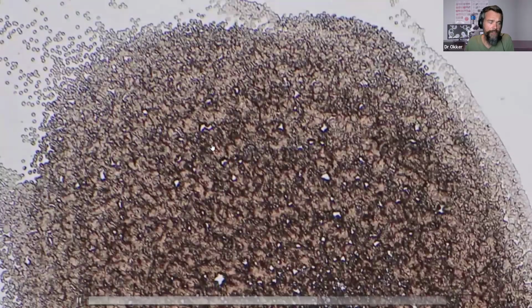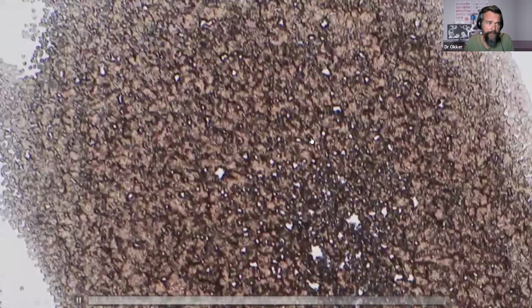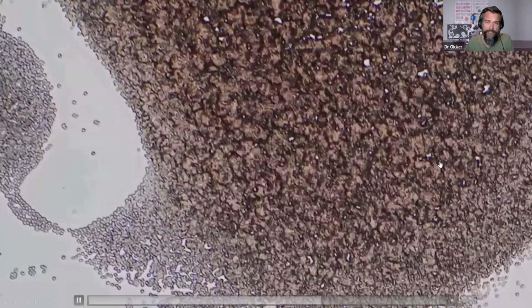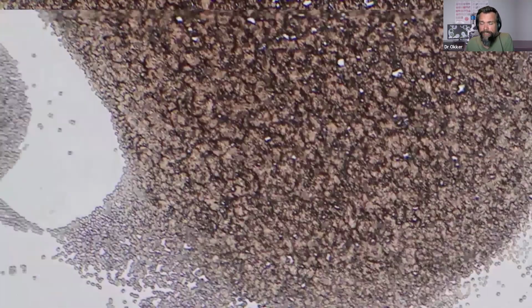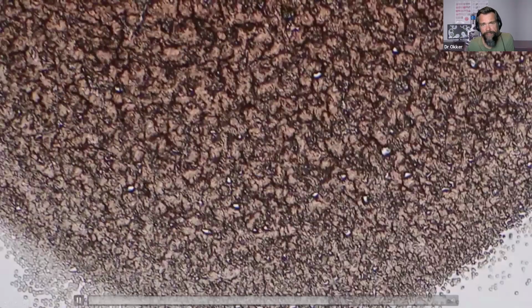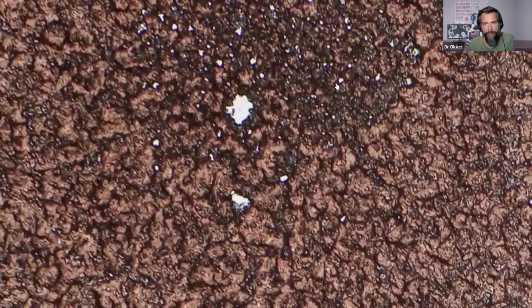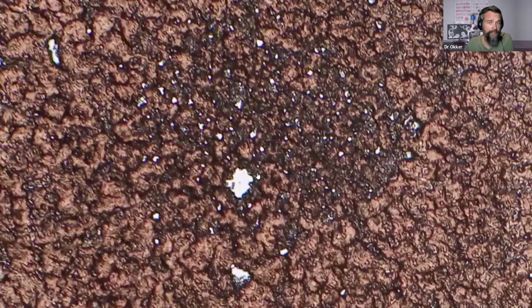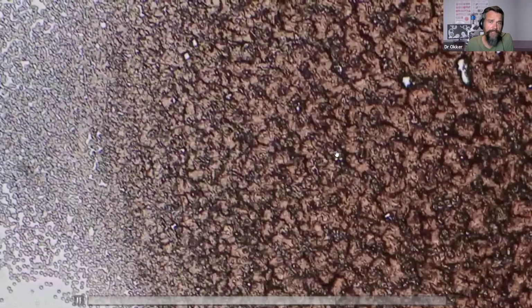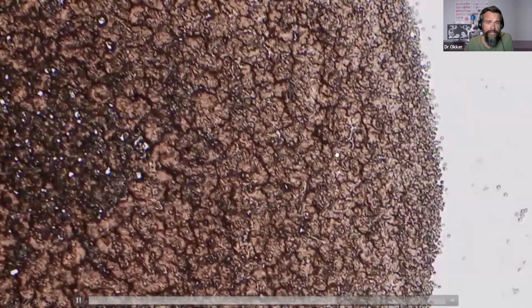All those white dots towards the center of the sample here are related to intestinal irritation. So we're seeing a lot of gut-related challenges here, and it's very useful to look at the dry blood sample because it often explains and complements what we've seen in the live blood sample. So in cases where we're seeing lots of fermentation signs, candida indicators, we often find signs of intestinal irritation as well. Often we see signs of bowel toxicity.